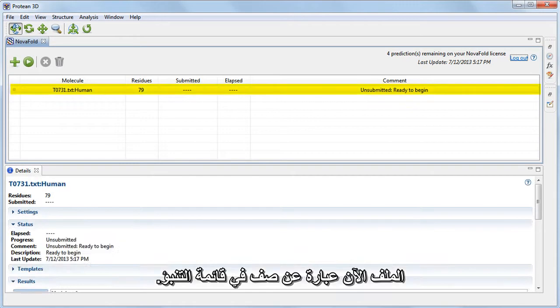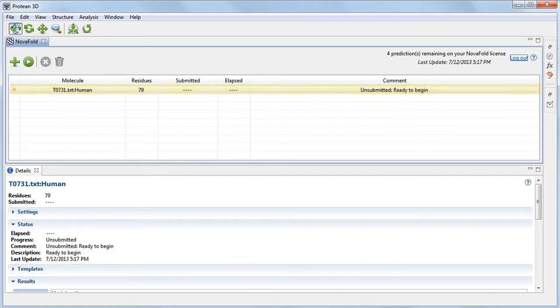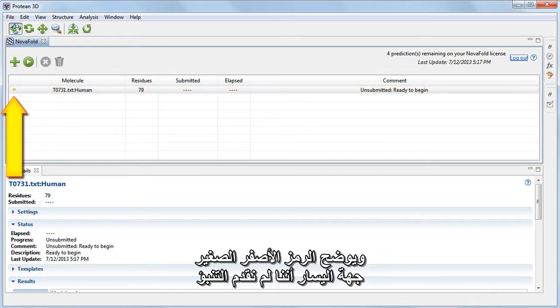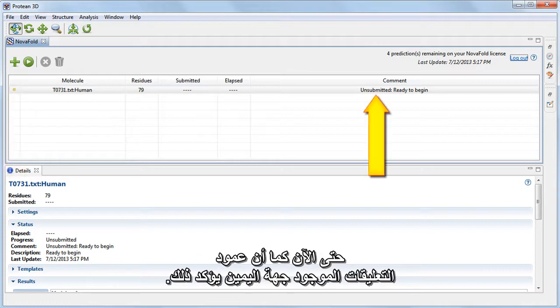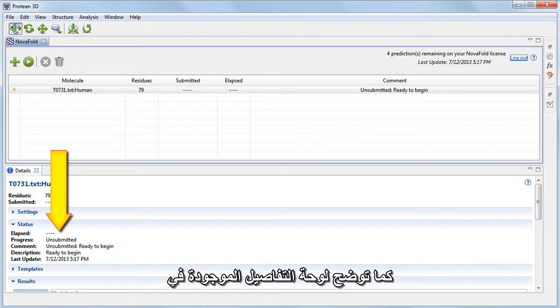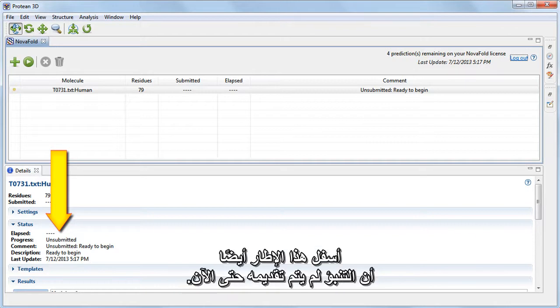The file is now a row in the prediction list. The small yellow icon at the left shows that we haven't yet submitted the prediction, and the comment column at the right confirms this. The Details panel at the bottom of this window also shows that the prediction has not yet been submitted.